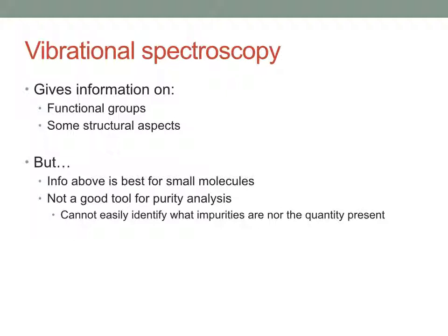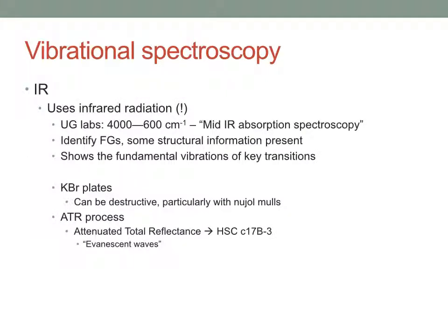One thing that I will say is that there are different types of infrared spectroscopy, that we've probably only really considered one or perhaps at most two of these different techniques before. I'm just going to mention those briefly now. So our traditional infrared, we look from 4,000 to 600 wave numbers.